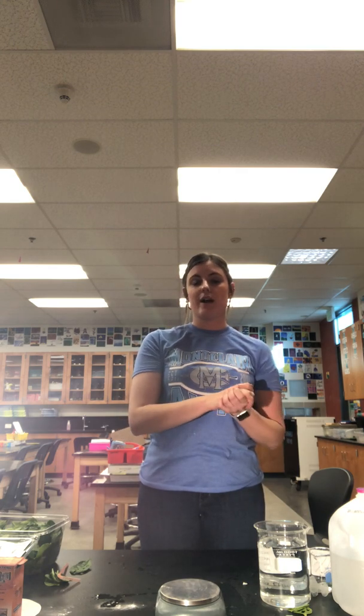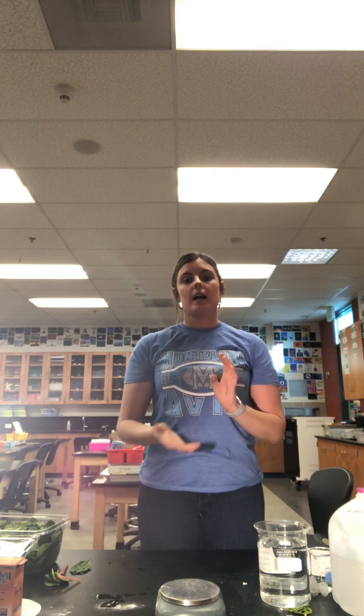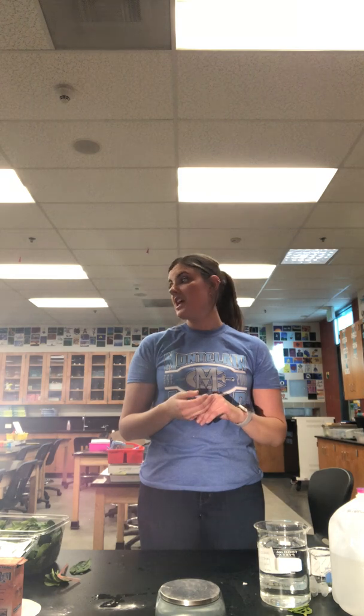Some students may put rate of photosynthesis as their y-axis. I would probably direct them to change that to the number of leaf chads that rise, and we use that number to represent the rate of photosynthesis. Most of the data on this experiment seems to work out. We usually have all of the leaf chads in the light experiment rise by the end of the 15 minutes, and usually if any in the dark experiment rise, it's maybe 1 or 2.